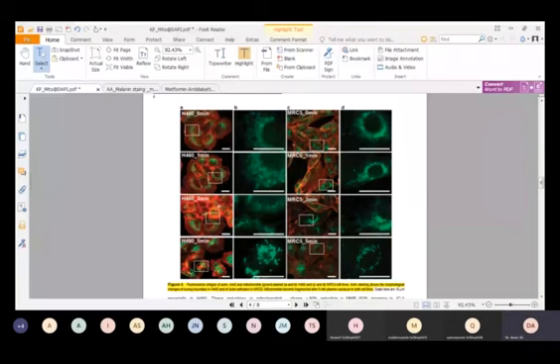In this sample, you can see this is the cell. If you look at this cell, the boundary of the cell membrane is bumpy, not regular, an uneven cell membrane as compared to here in control. So these are the morphological changes after plasma exposure. It means by using the staining technique, you can observe the change in morphology as you did here.